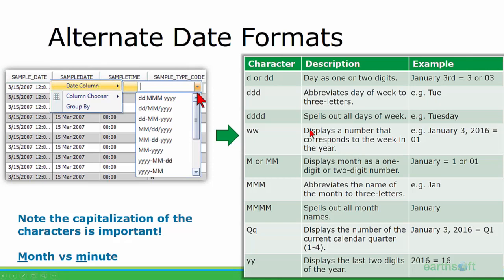A handy one here that certainly comes into play in a lot of ERSA scheduling is the week number, so you can include the week number in your date. Additionally, something that I love for crosstab report organization, you can add a quarter format. So for whatever the date falls in, it would indicate Q1, for example. You can also, of course, append the year, so it's not just a bunch of Q1s and you can tell the difference between those.